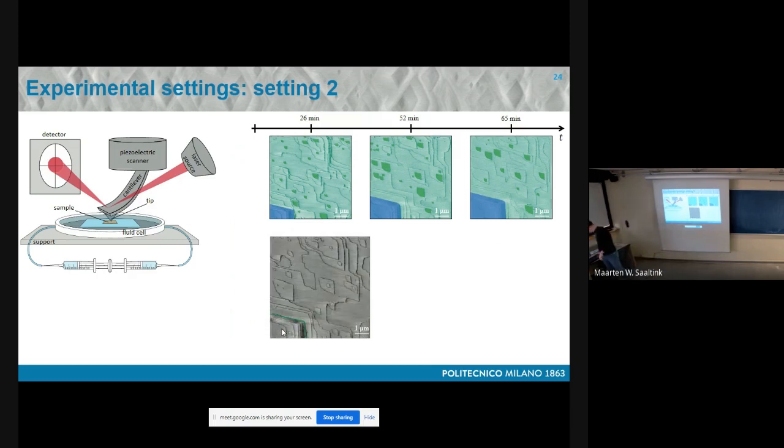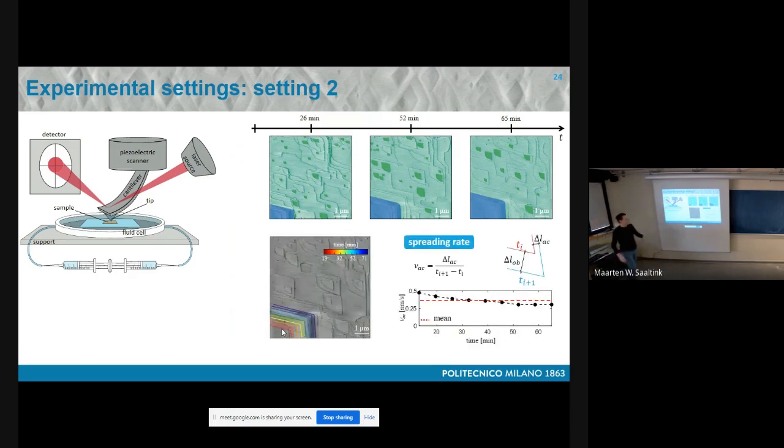You can analyze these images and you can come up, of course, with estimates of the rate of spreading of the pit by taking some averaging of these distances over time between two different locations of the pit. So you can also have, of course, a dynamic description of the topographic surface of the system, including the different topological elements which take place on the surface.